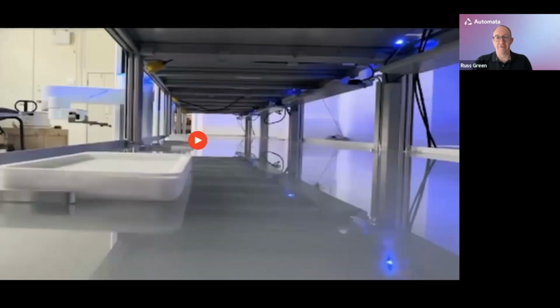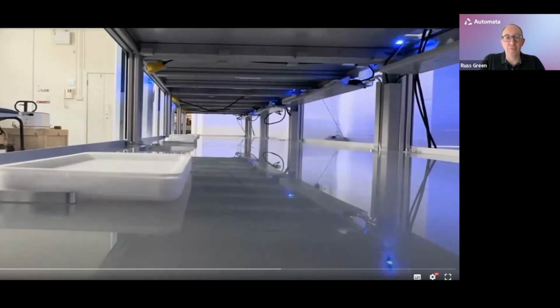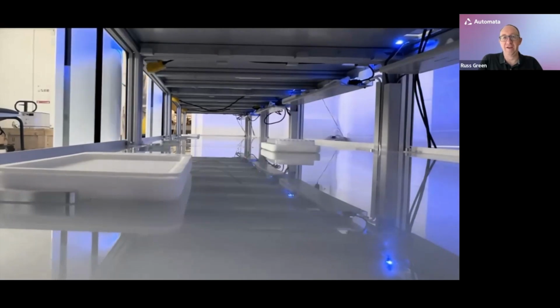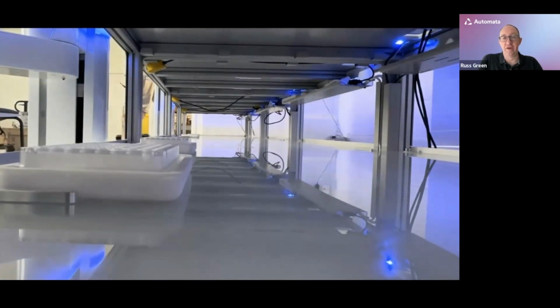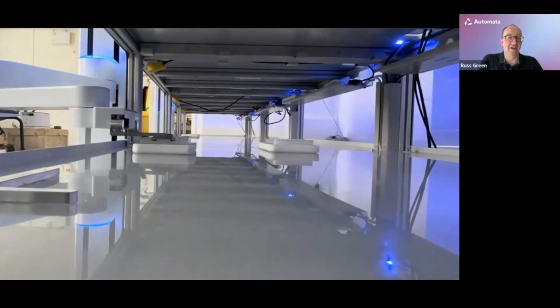Just to share with you a little bit of video footage of that transport layer in motion. Here we can see one of the pucks carrying a piece of labware over the surface of that transport layer, moving it into position just in time for that robot to come and pick it up and move it up to the surface of the integration space. In this case, it is actually moving it onto the deck of a Tecan liquid handler.